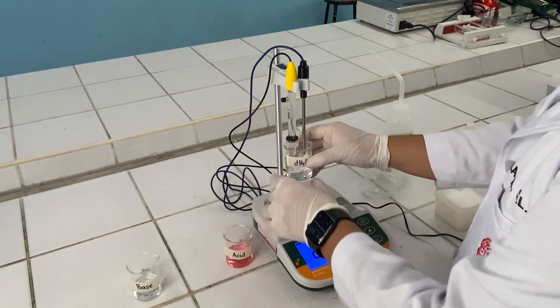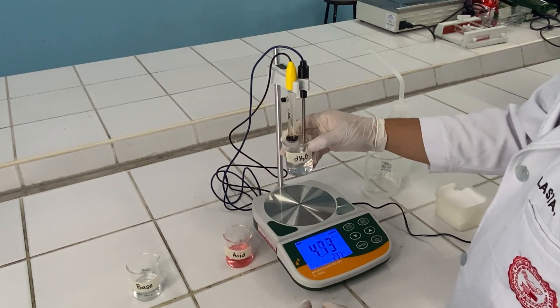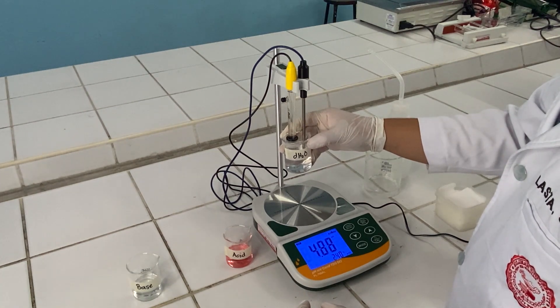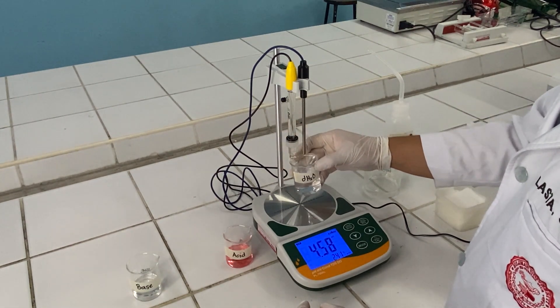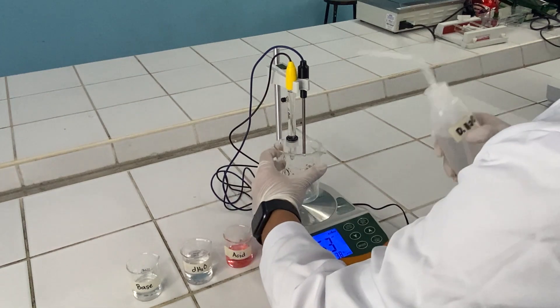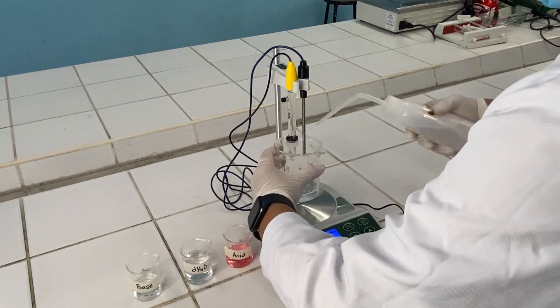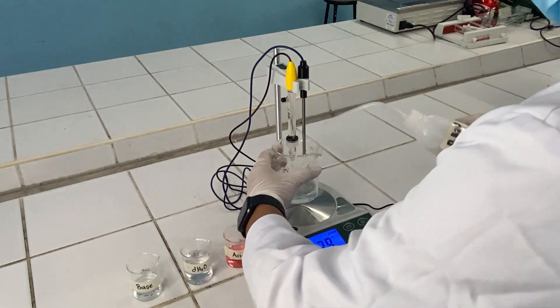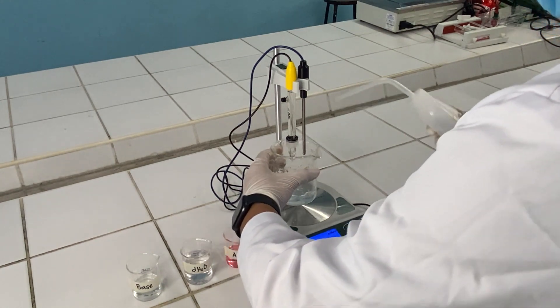Submerge the bulb again under distilled water to remove any residual solution. Then rinse it again with another distilled water. It is very important to wash your electrode, including your temperature rod, after every solution so as to prevent any inaccurate reading.